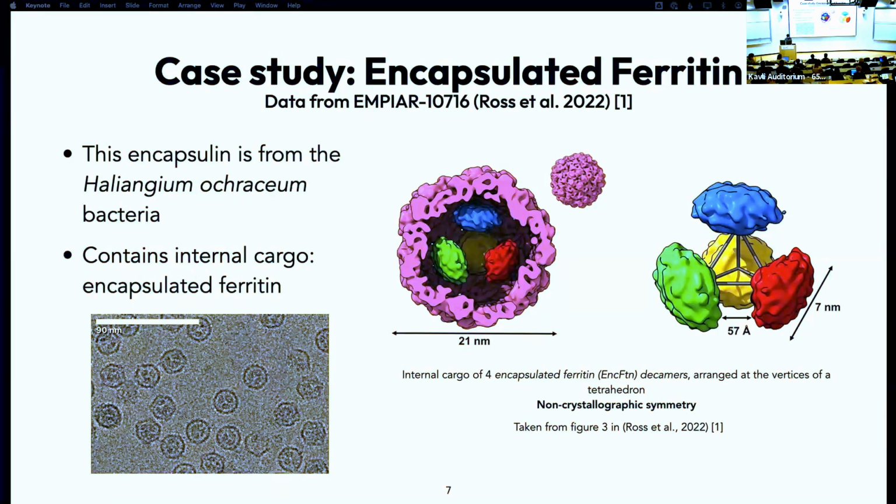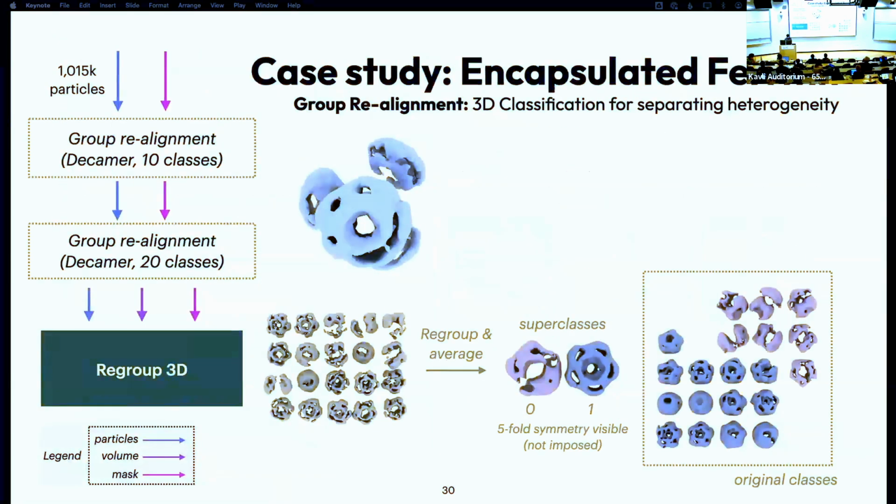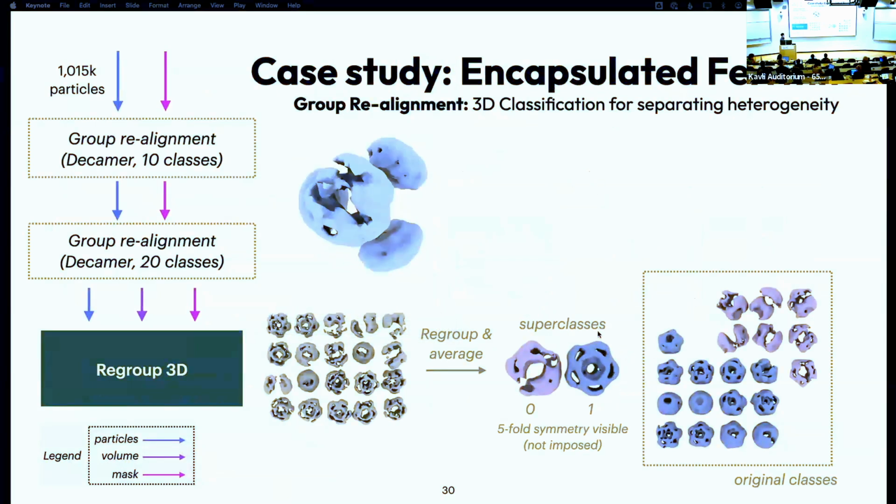I think where it would have been most clear is when you get to this point where you can kind of see it in your structure here. At this point, I was like, okay, there's probably a subset of particles where it is an intact 5-fold symmetric object. Then the question is, is it C5 or D5? So again, it's kind of hard to answer in general.